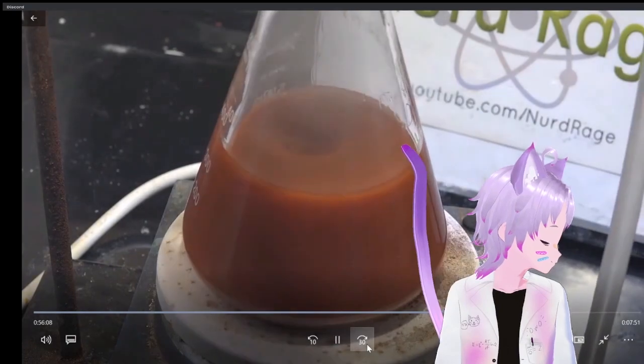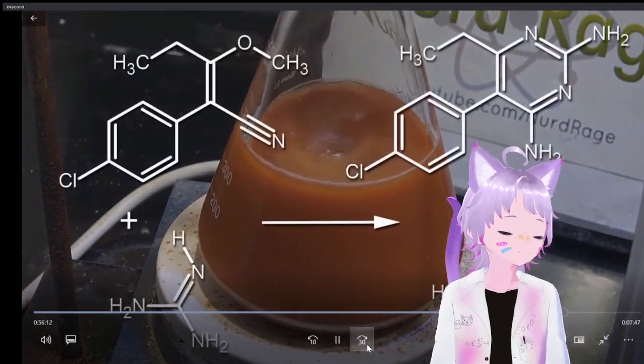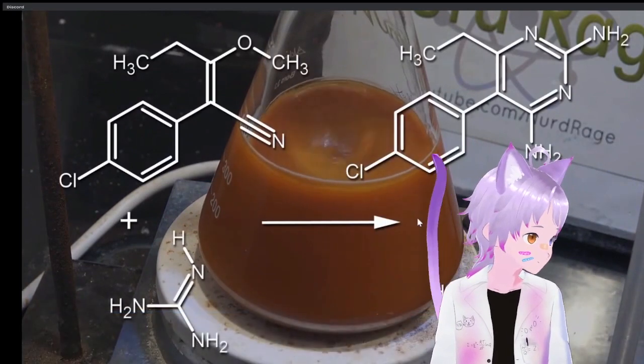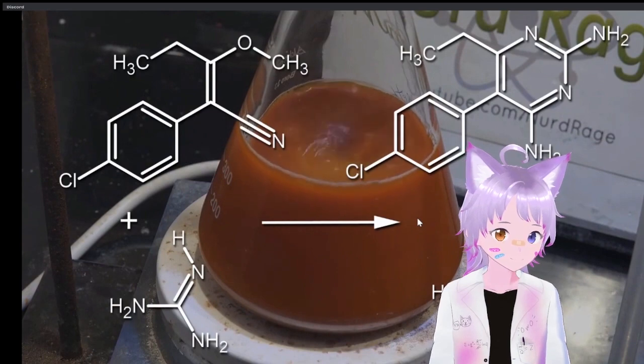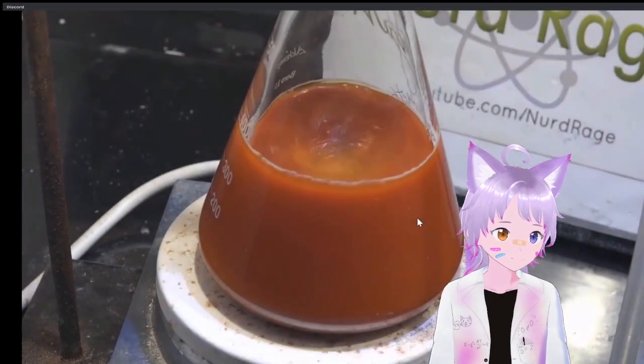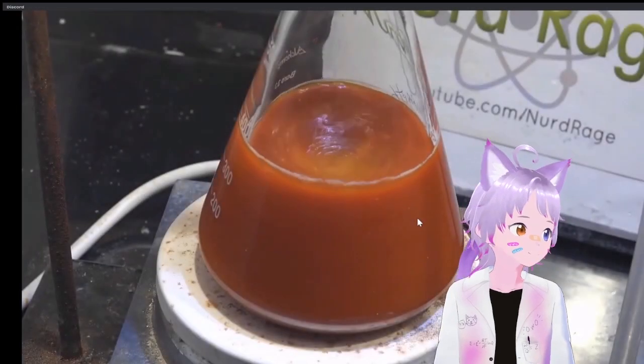Now put the reflux condenser back on and start refluxing the mixture. What we're doing here is reacting guanidine with the enol ether to form a pyrimidine ring. This is the final reaction in making pyrimethamine. The reaction is slow, so you'll need to reflux for a long time. I left this going for 36 hours. And here we are, 36 hours later.